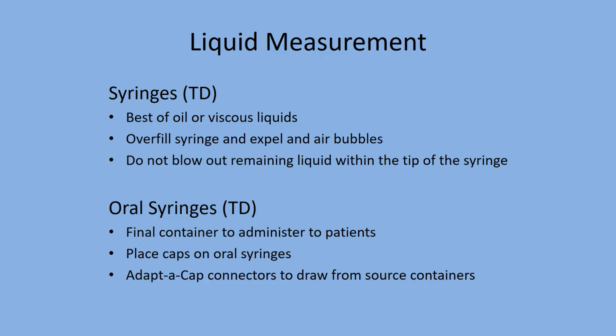I like using syringes to measure because after you're done measuring, you can just throw it out. For glassware, you'll have to clean it. And it takes a while for anything super thick to flow down the side. So you might get a bunch of bubbles that form. So using a syringe makes it a lot easier.